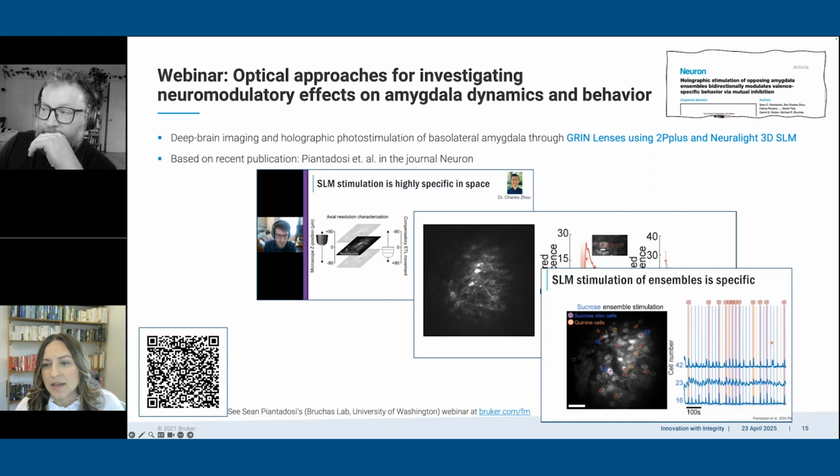They ask, is it possible to make a field portable, miniaturized, super resolution, two-photon microscope that can image tissues like brain without losing information to the light and matter interaction? And they clarify further that they want to go beyond Abbe's diffraction limit. So what do you think about that, Kevin? Is it possible to make a field portable, miniaturized, super resolution two-photon microscope for imaging brain?